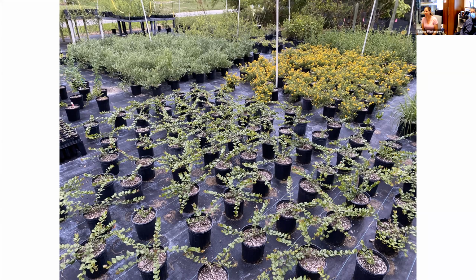And then Naki said, can you confirm the acid you used for the cactus seed, was it salicylic acid? It was sulfuric acid. Sorry, I have to repeat the question. Naki asked us to specify the acid we used for the Key tree cactus. We used sulfuric acid in 5% concentration. The seeds were soaked in there for 5 minutes and then rinsed for 15 minutes in water.